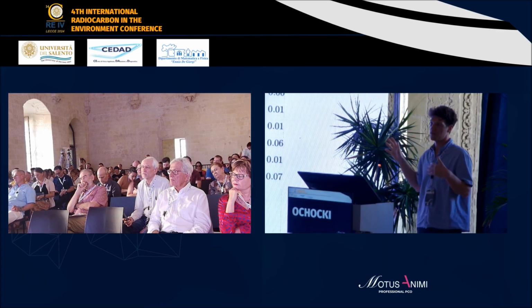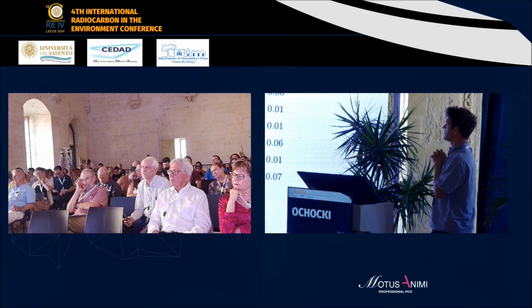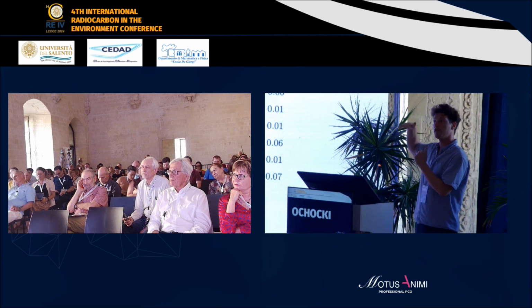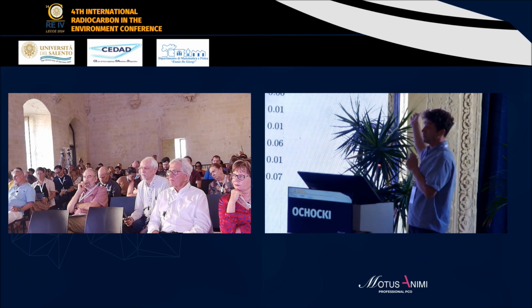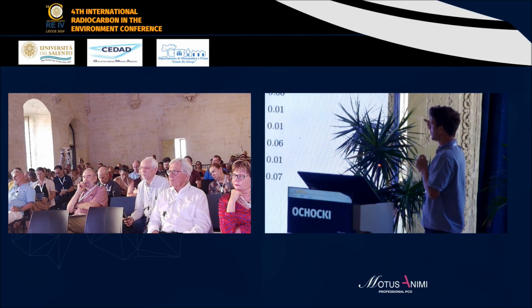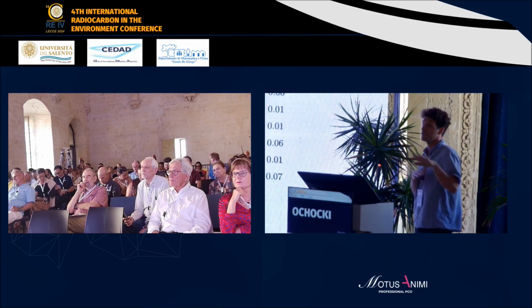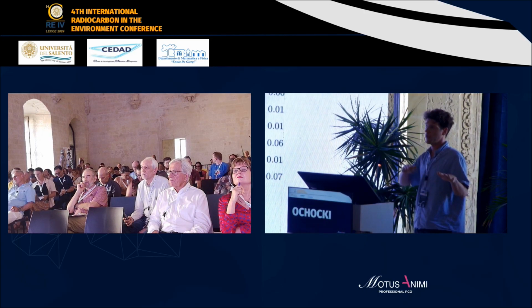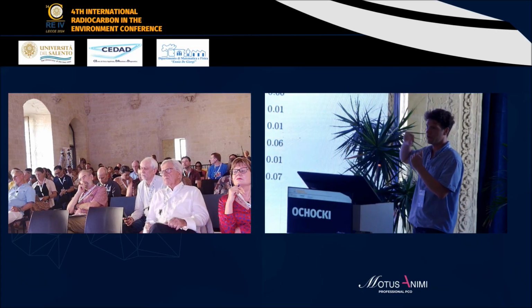ABOX-SC method, which I think was developed in 1999. In those experiments, there were 3 temperature steps. In the lab, we disregard the first temperature step, so that I think it was 400, 600, 900.